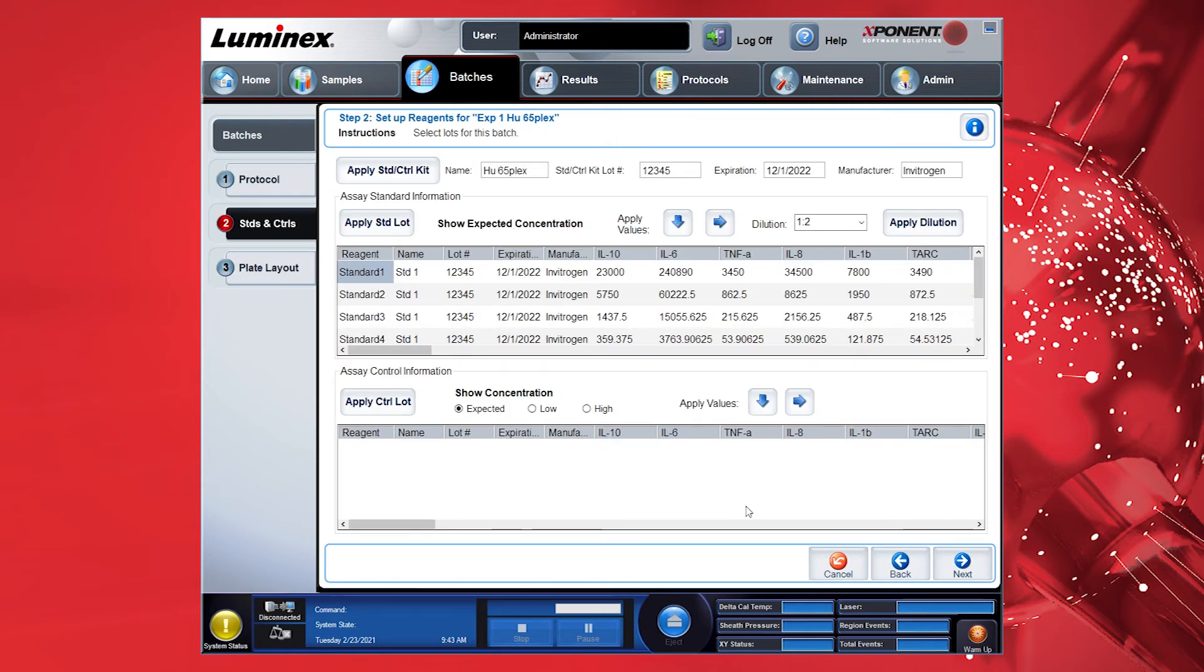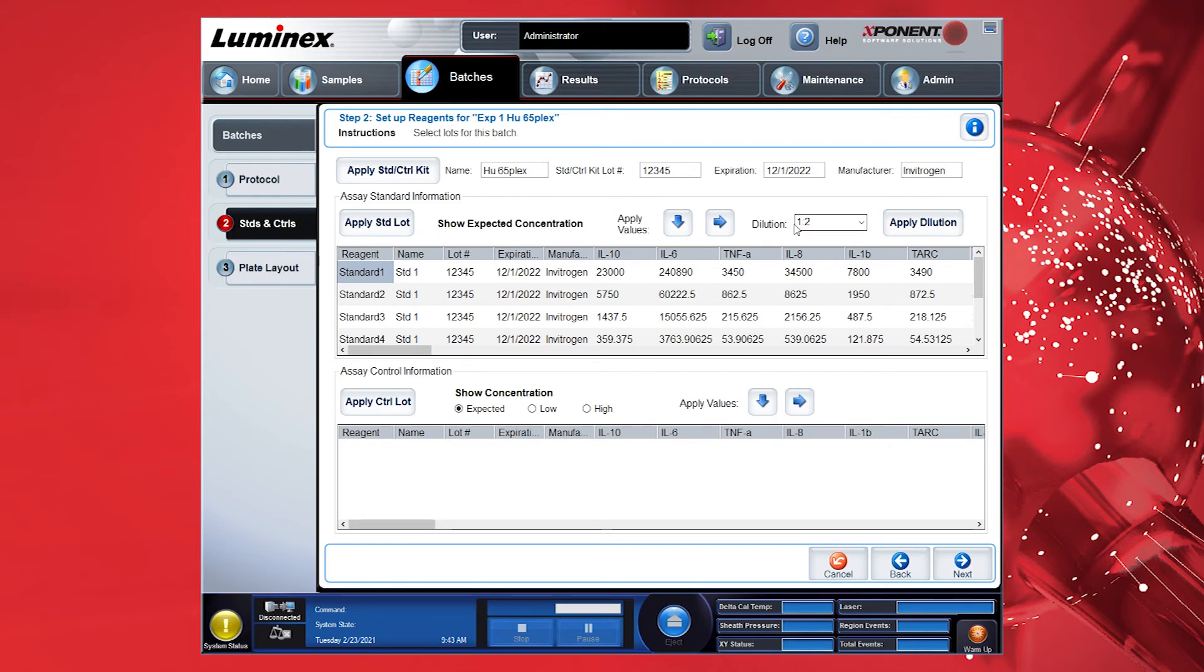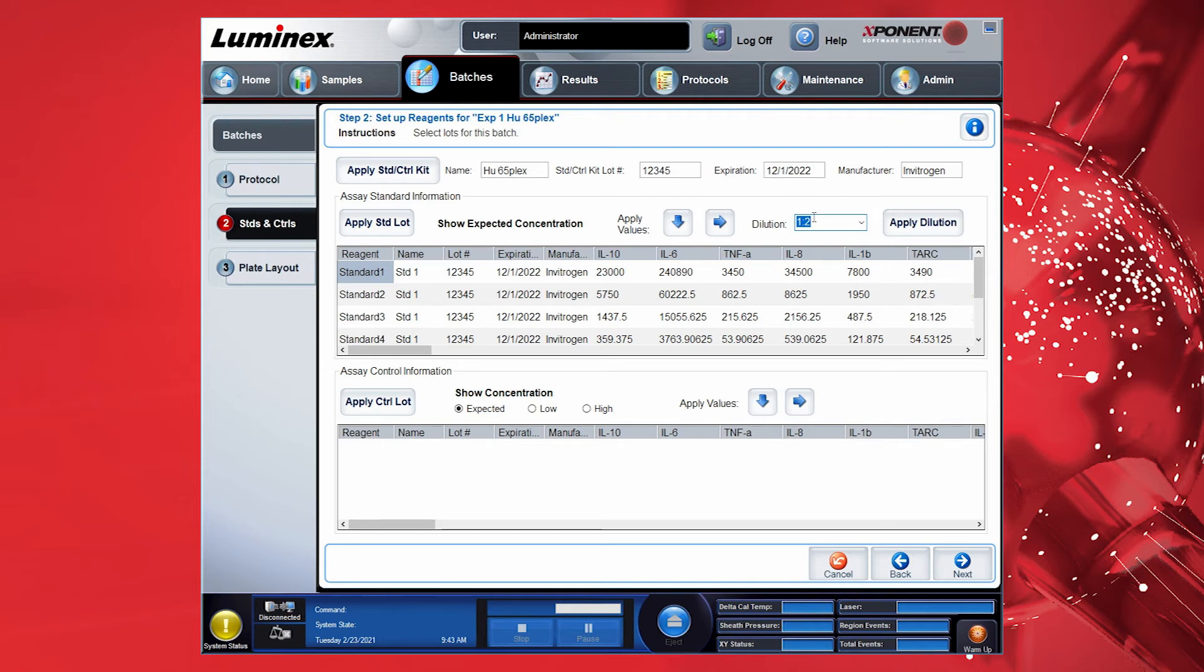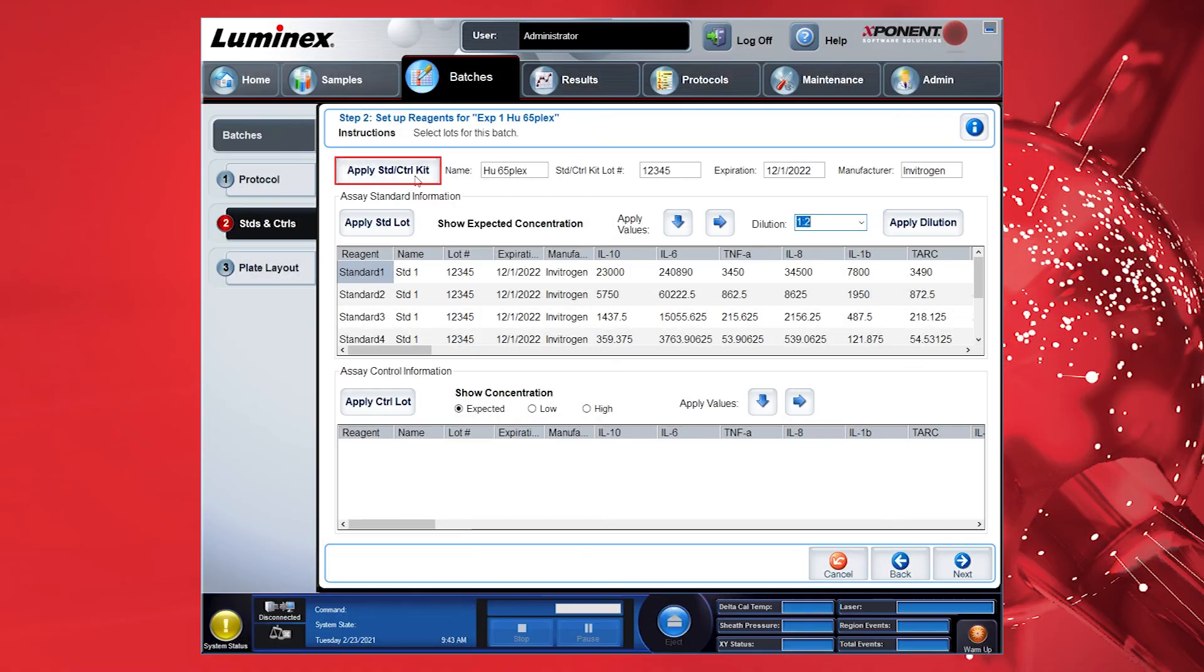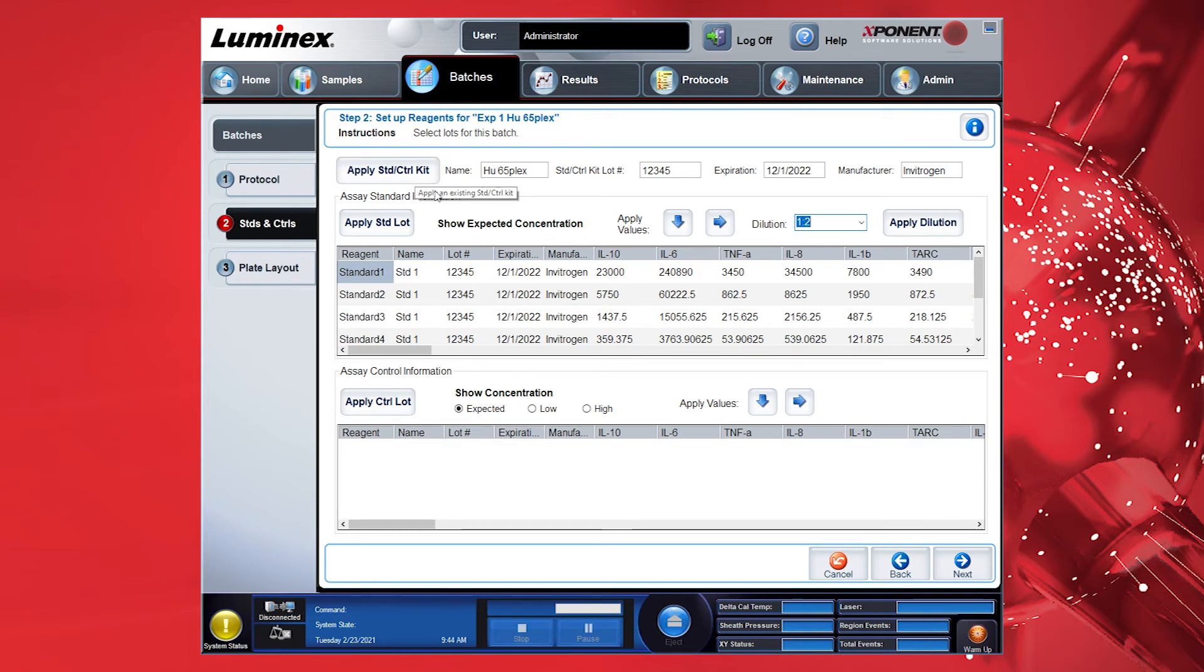This will take you to the Standard Info section that you created in the Protocol Setup. Check the standard lot if it is the correct one. The Dilution Factor drop-down will default to a 1-2 dilution, but the concentration of the standards will have applied a 1-4 dilution, as this was applied previously in the Protocol section. You can use the Apply Standards slash Control Kit button to change to a different lot if desired. Click Next.